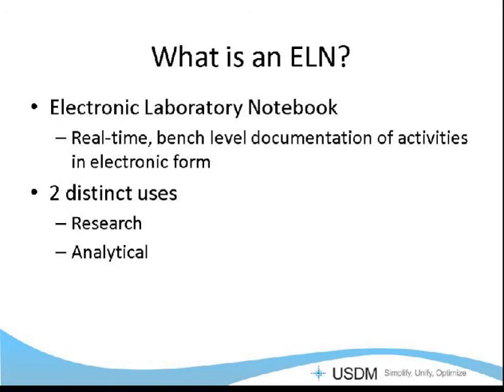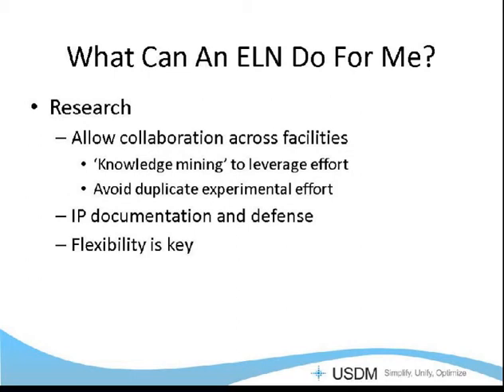There are generally two distinct uses for ELNs. There's a research type and the analytical type. The research ELNs have been around for a lot longer than the analytical. They're designed to allow collaboration across different facilities, different analysts. The keyword knowledge mining is pretty hot now. Basically what that is, you want to be able to search to see if anyone else is doing experiments so you don't duplicate the effort, or you can build upon something else that someone is doing and not have people stepping on each other's toes as far as experimentation goes.